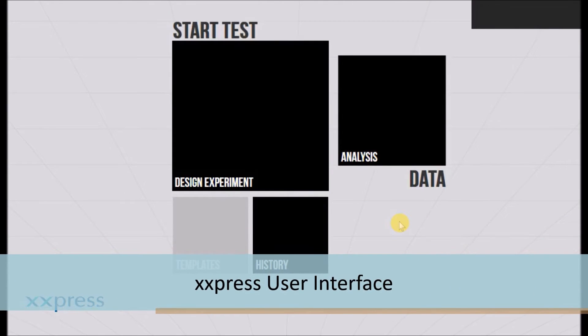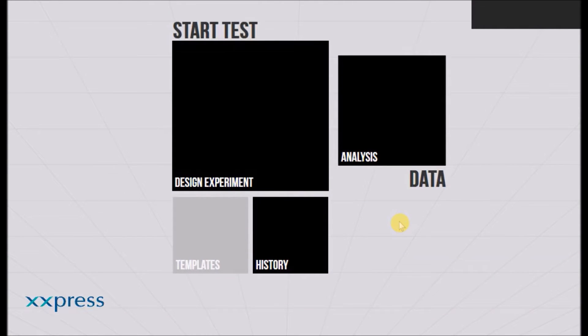This here is the home screen of the Express user interface. It's been designed by a biotechnologist to make it both intuitive and easy to use. It operates using a touch screen, fully functional even with lab gloves on. There are currently three tabs available for use.